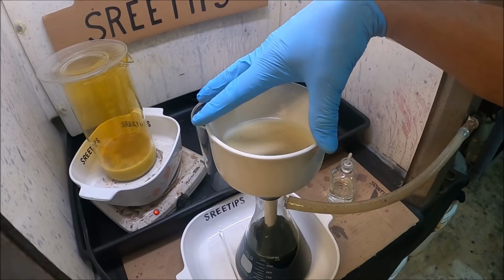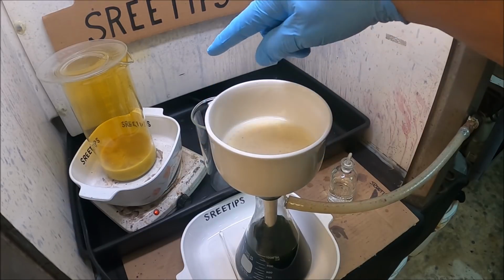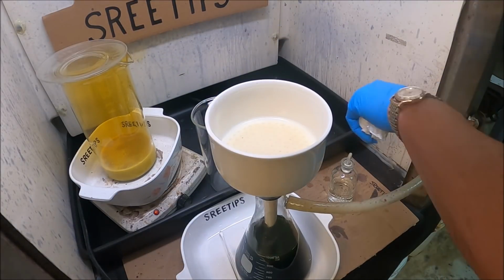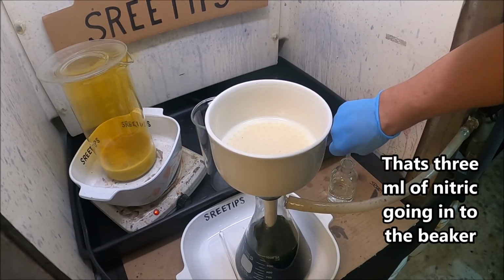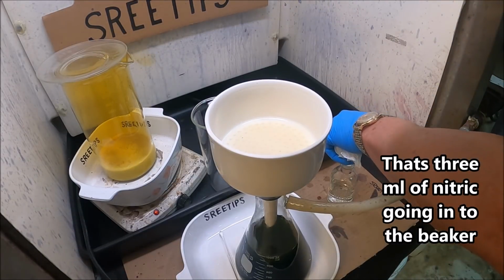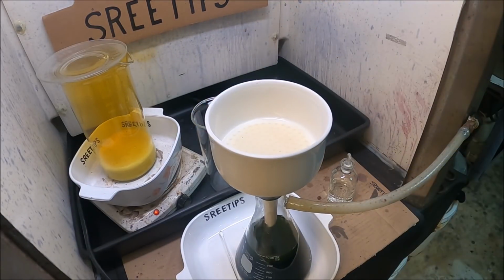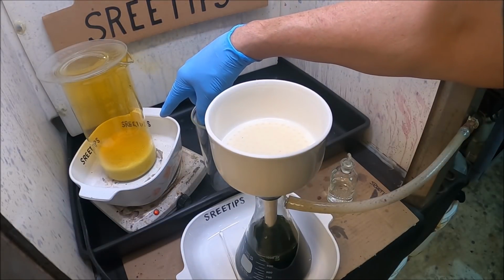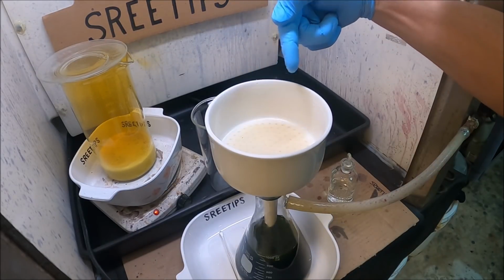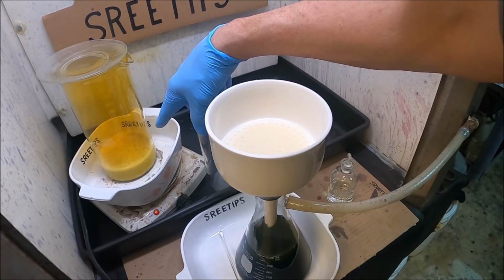What I'm going to do here is turn the vacuum off now. Let this set. I'm going to add some more nitric to the contents of this beaker back here and let it cook for a little longer, and then once it stops reacting, what I'll do is swap this funnel into a different flask, and then we'll pour the contents solution out of this beaker through this funnel. Pull everything through here. It's already loaded up, so it will do a good job of getting all the fine particulate out of this solution.